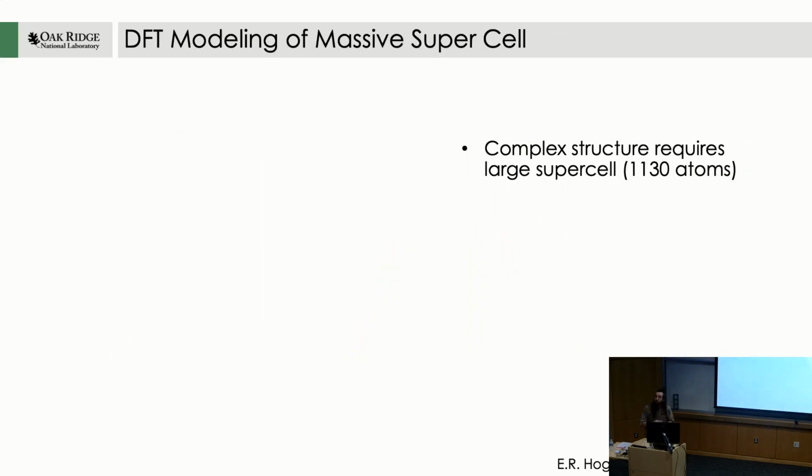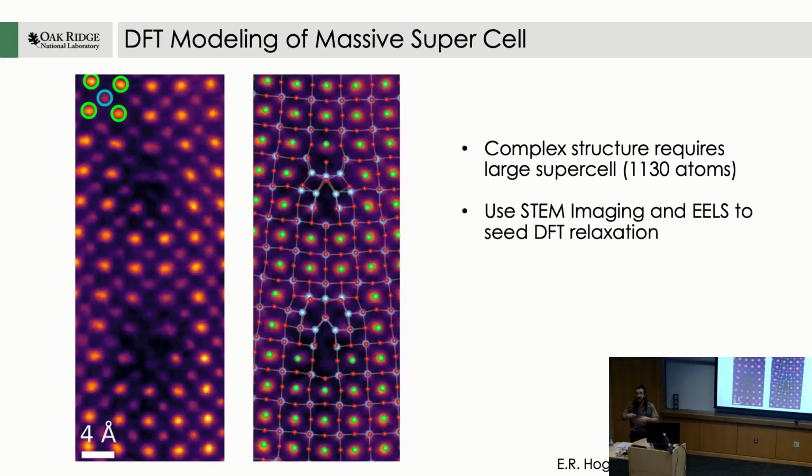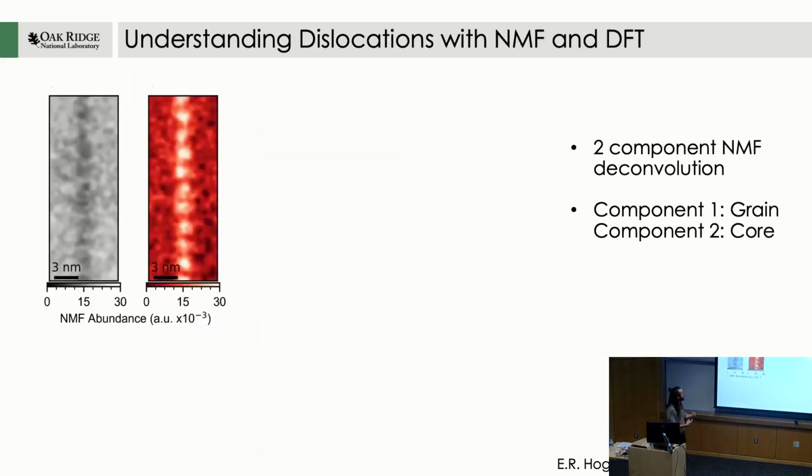But the real nice thing is that we can compare this to DFT, and we can do theory modeling of the dislocation cores themselves. This had so many atoms in it that we really had to use the EELS composition and atomic resolution imaging to form a model that would actually relax with this complex dislocation core geometry. But we were able to get it done, and this allowed us to do a direct comparison of the experiment and the theory for the vibrations of dislocation cores.